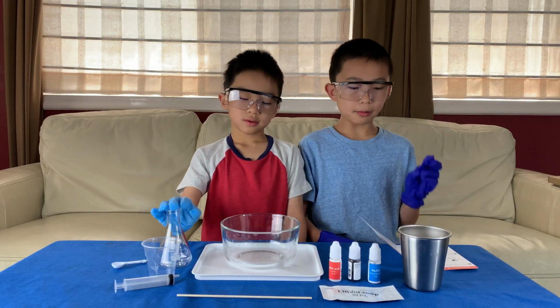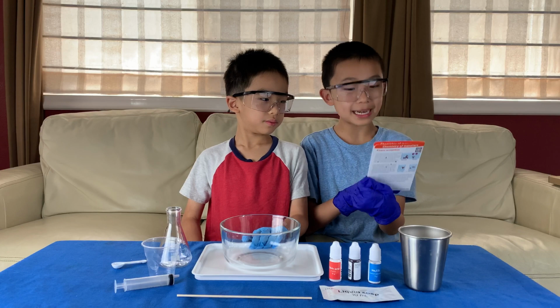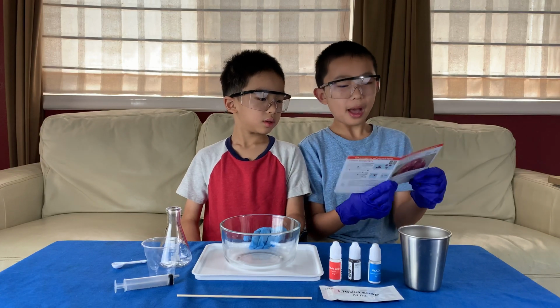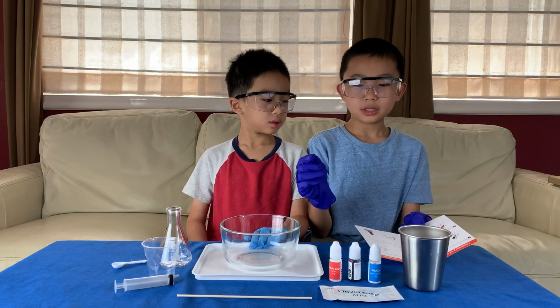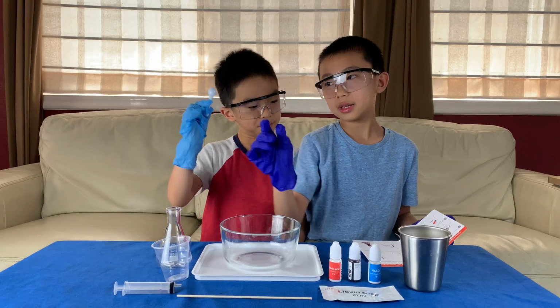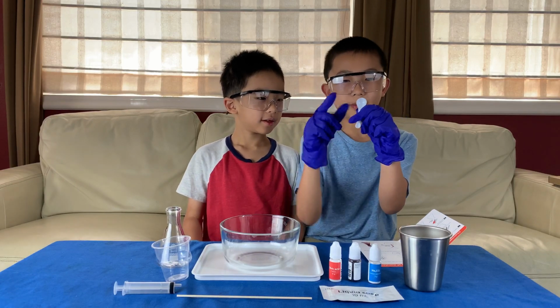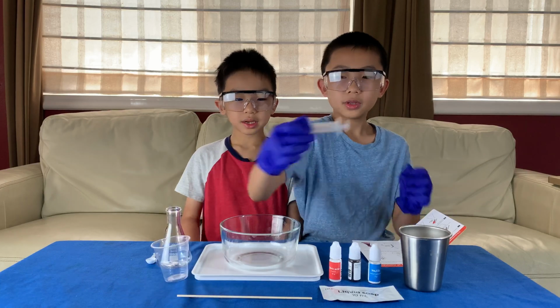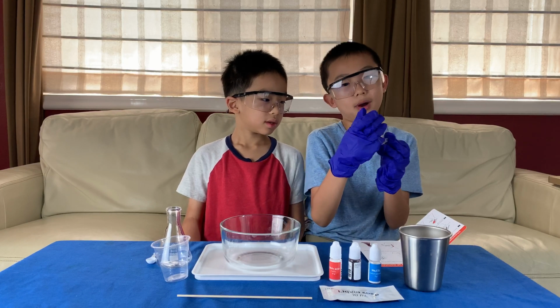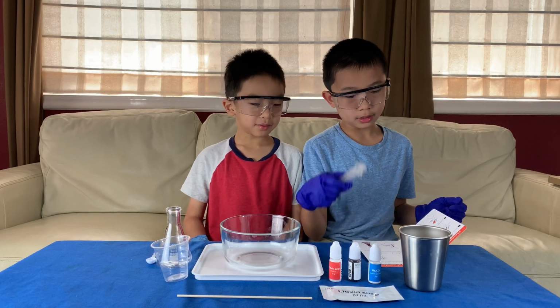Okay, so we are ready for our first experiment, foam eruption, which has difficulty 2 out of 3, danger 1 out of 3, and duration 15 minutes. At the end, our result will be like this. I read through the instructions. It seems pretty simple. We have the flask from the starter kit, a disposable cup from the starter kit, and a big spoon. They say a big spoon because there's a small one and a big one, so we'll be using the big one. There's also a shot thingy, which we'll use to measure 20 milliliters of water.